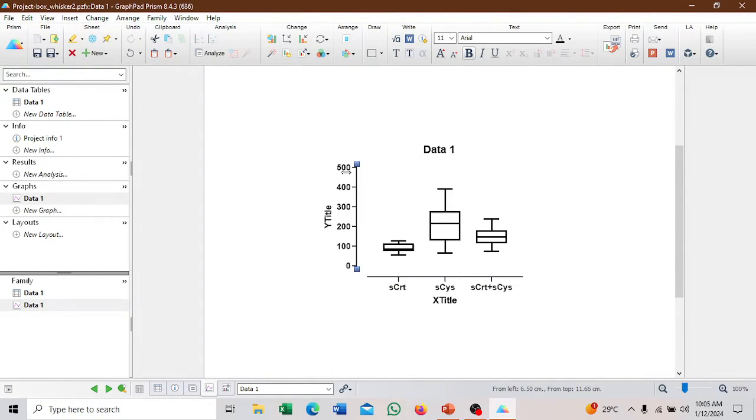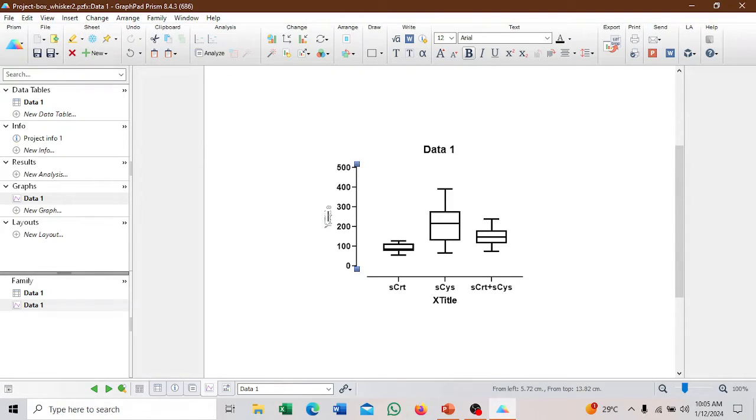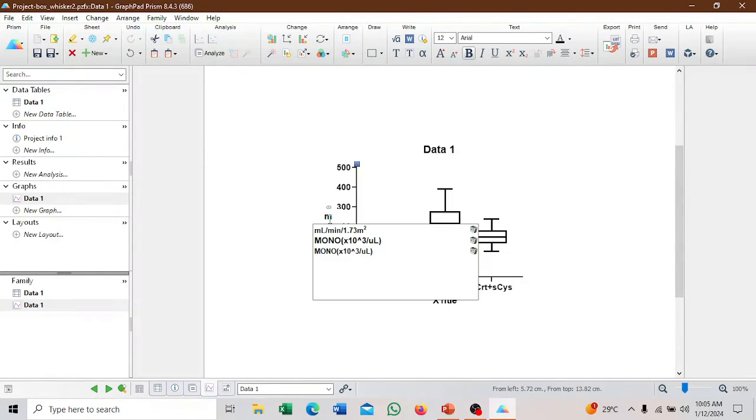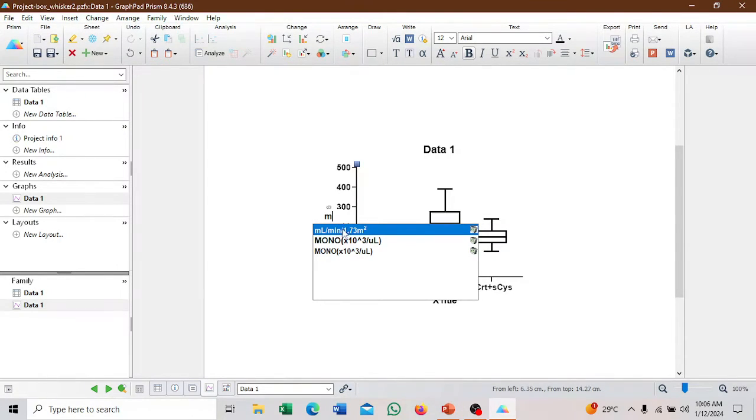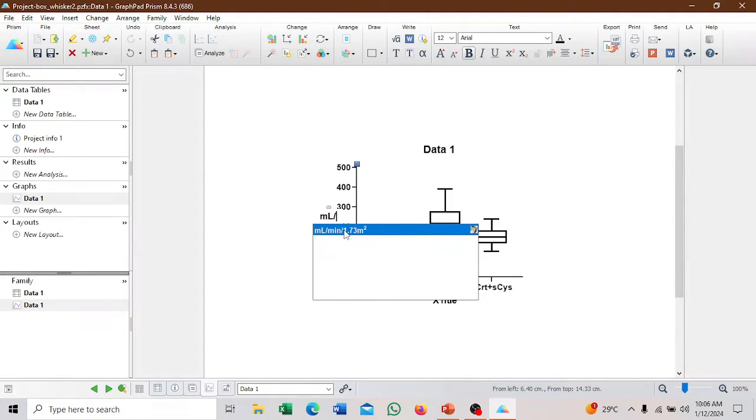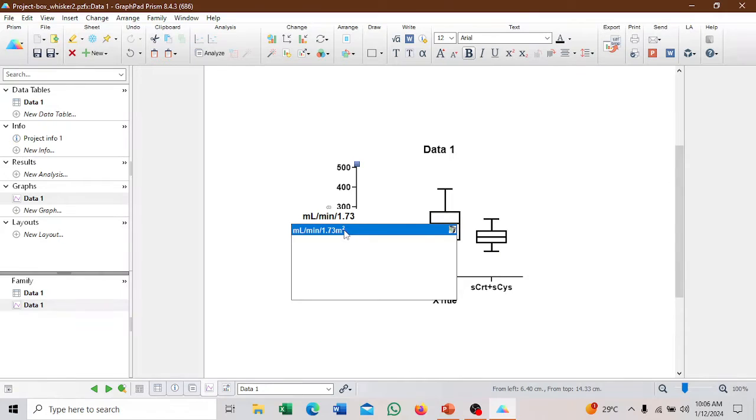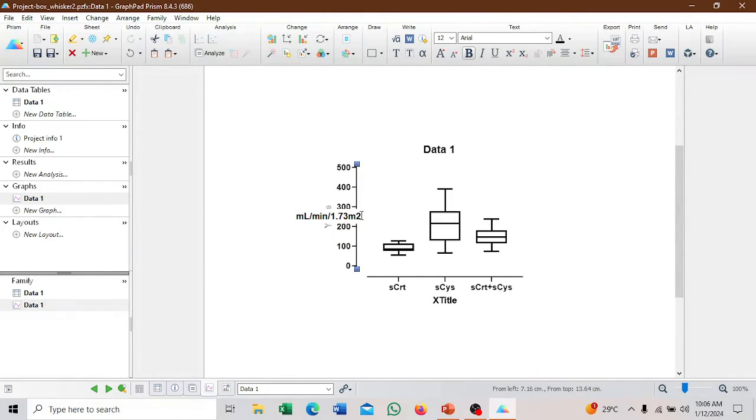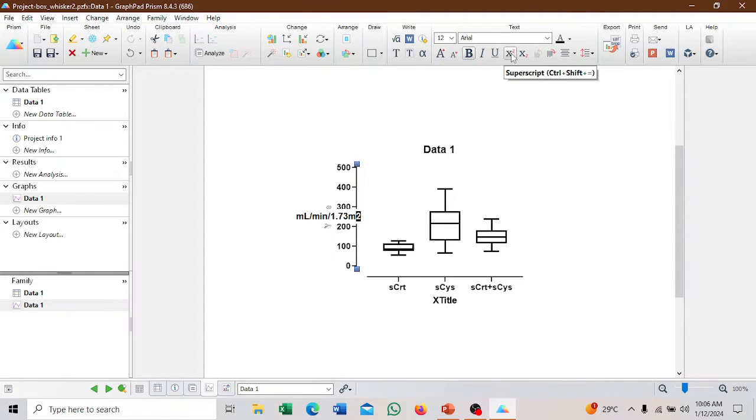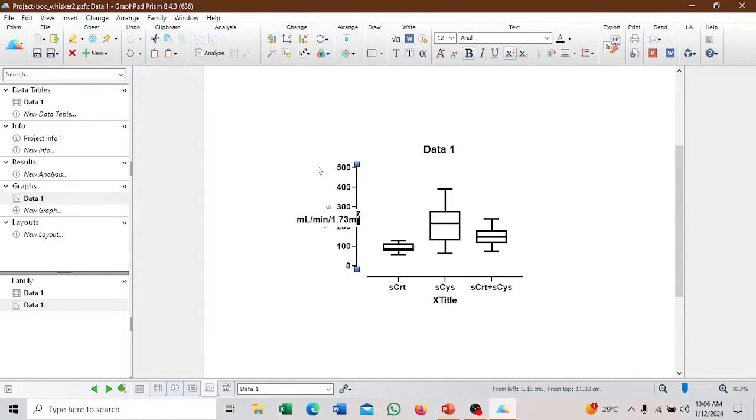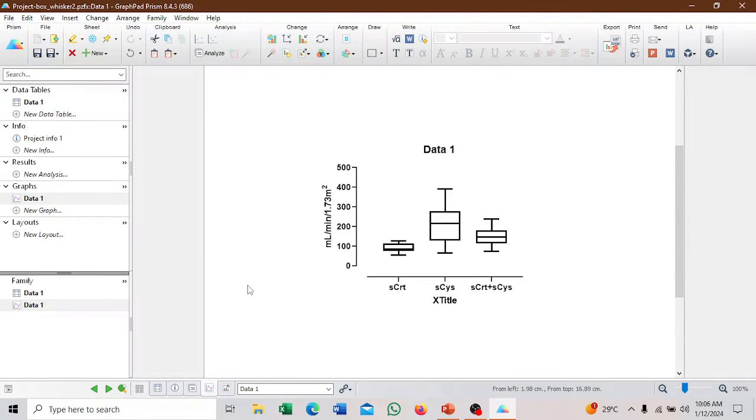The unit for the EGFR, we have to key it in. It's ml per minute per 1.73 meter squared. You can type it in. ml slash minute slash 1.73 meter squared. The squared, you have to format as X raised to the power 2. That is the unit for the estimated glomerular filtration rate.